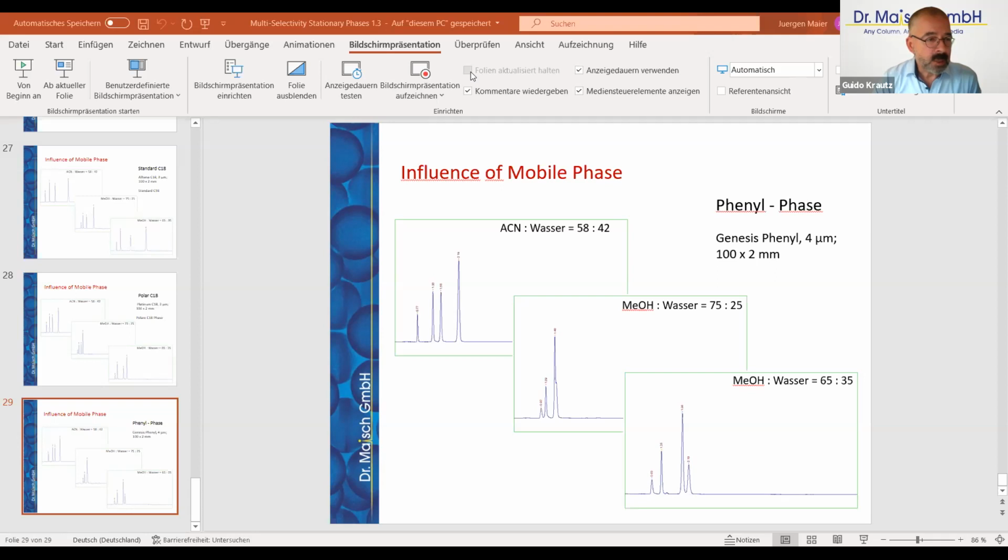I believe we have one, and there are various possibilities to separate saccharides. Yeah, can you remember what that application requires? I have to look which one is the best one, but it's a HILIC application, of course.